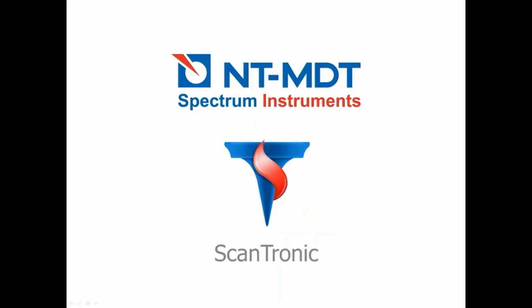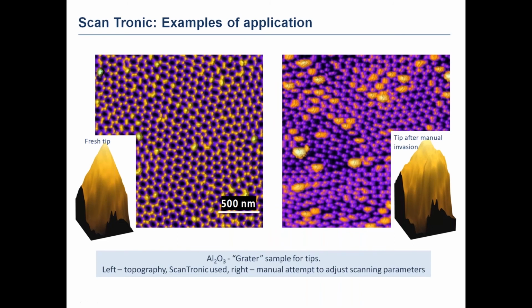This example shows that during the automated scan, we have quite good quality of the results. After the manual attempt at adjustment, unfortunately, the cantilever was broken, and then coming back to the automated parameters allowed us to get an image with almost good results, but the cantilever was already slightly damaged.